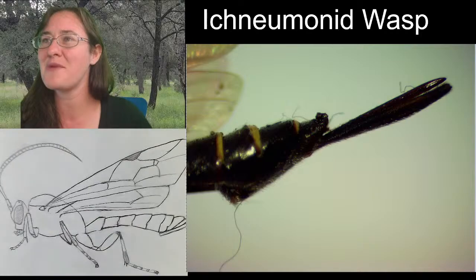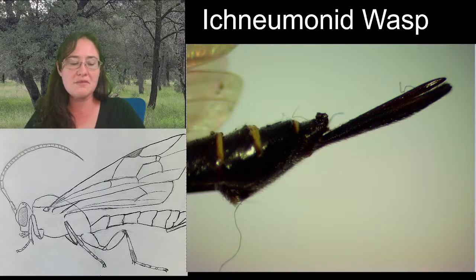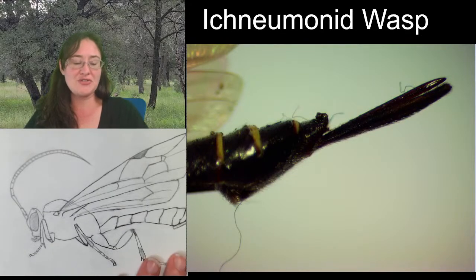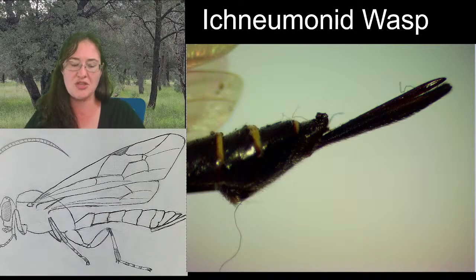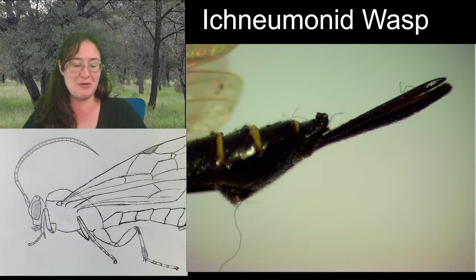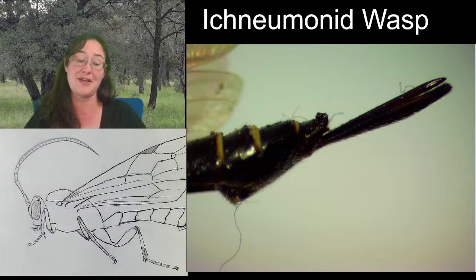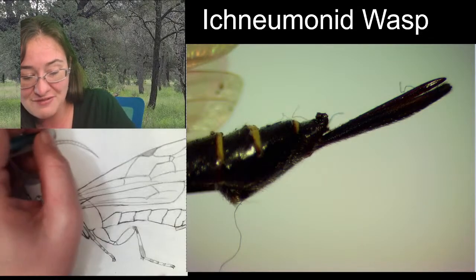All right, ladies and gentlemen, it looks like we've got our wasp ball figured out. The big characteristics for ichneumons are the horse head and the inside of the wing venation. That's really all you need to know with them. And when you get down into the species, it's pretty much impossible. But I believe we probably could identify this one down to genus with a really good picture put onto iNaturalist. But I just have not yet done that.